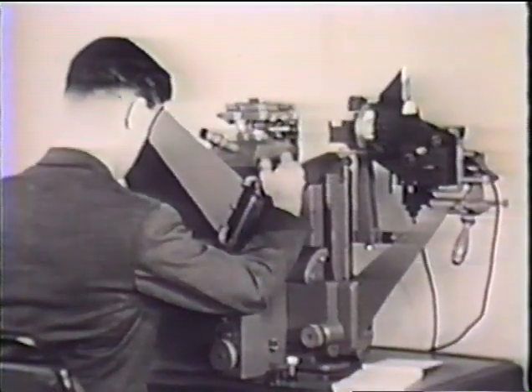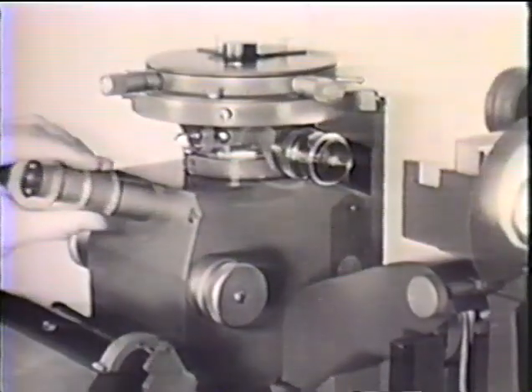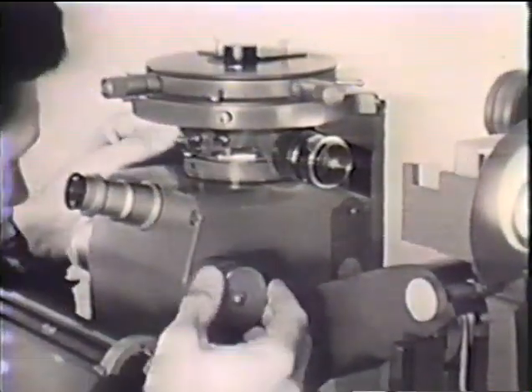This projection microscope is particularly suited to the study of opaque objects. Here is an unedged sample of ingot tin viewed by ordinary incident illumination. It's almost featureless.